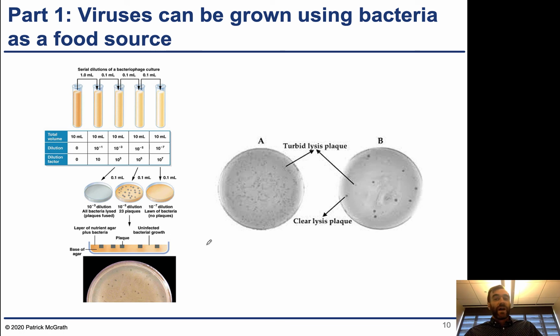And finally, we're going to cover viruses as well, or phages. So viruses and phages are kind of used interchangeably here, but a phage you can assume is a virus that targets a bacteria. So you can also grow viruses in the lab, and typically you're interested in phages that infect bacteria. So these viruses bind to bacteria. They inject their RNA or DNA and protein contents into the cell. They hijack the cell, and then they produce a large number of new phages, and eventually lyse the cell and release to repeat the whole infectious process.